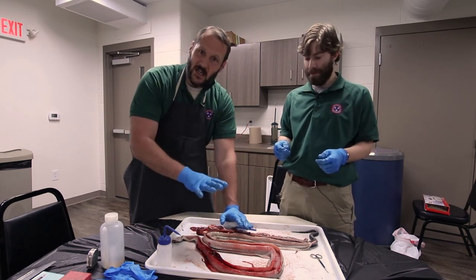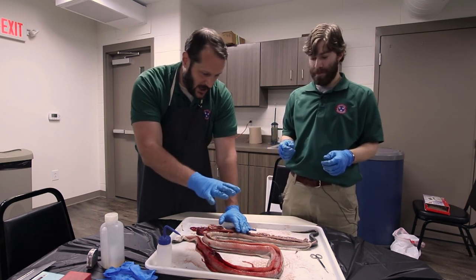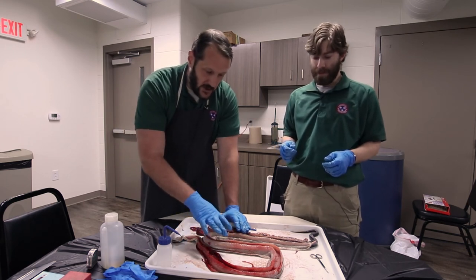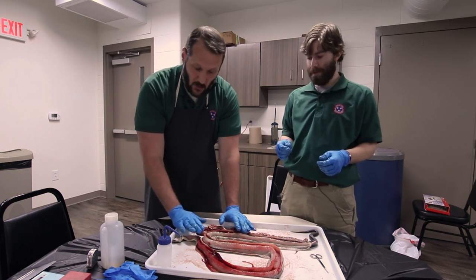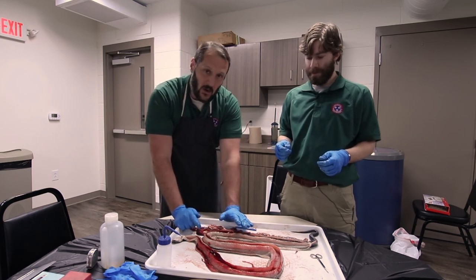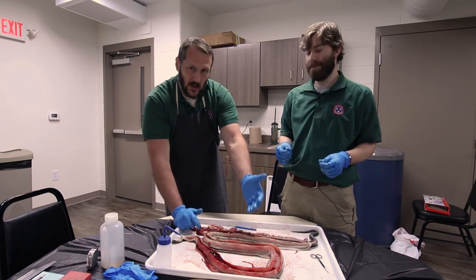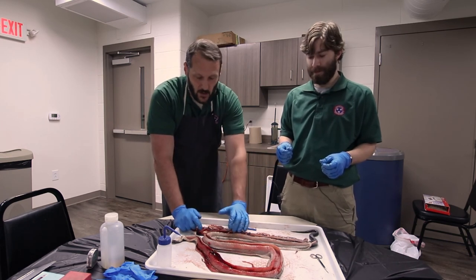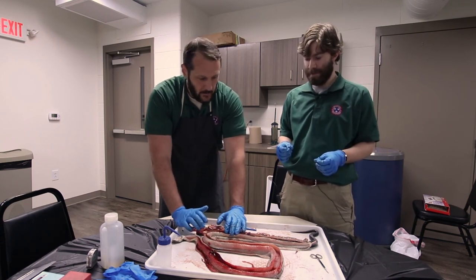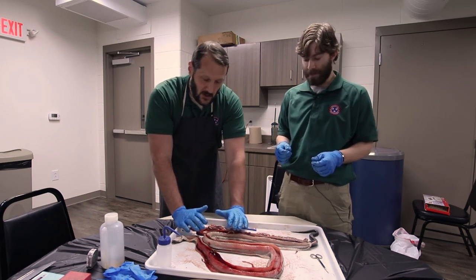So this specimen is not done. It's going to continue its afterlife, assisting with research projects for us here at the Nature Center and future research. So once again, just want to reiterate that this animal was run over by a car. We can find that injury here. We don't collect wildlife at the Nature Center unless it's what's called a salvage. We collect it if it's already died of natural or accidental causes. So we are sad that this animal has left the world of the living, but we are excited that we can learn from it and study and research it in the future.